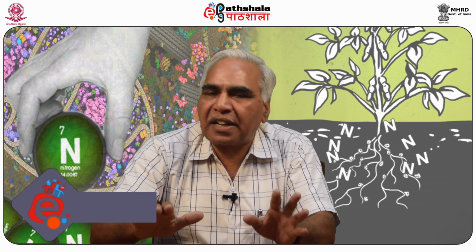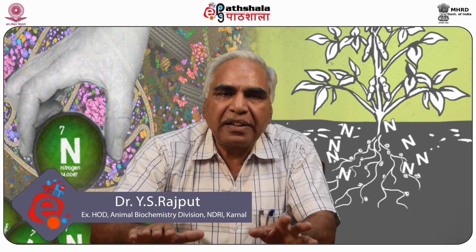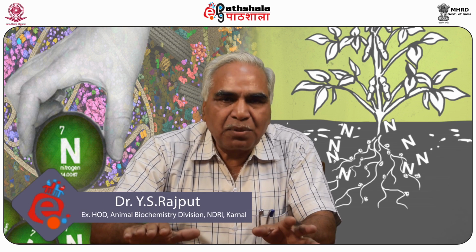These concepts will finally help in understanding the specialized electrophoretic techniques, including acrylamide gel electrophoresis, agar gel electrophoresis, capillary gel electrophoresis, and isoelectric focusing.